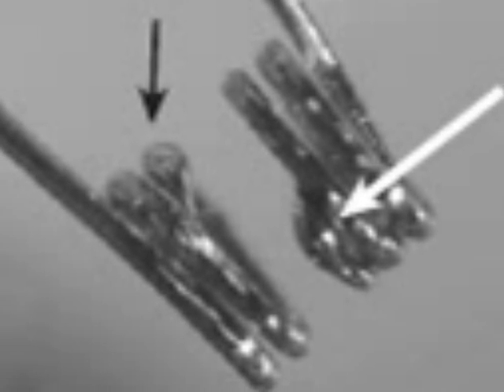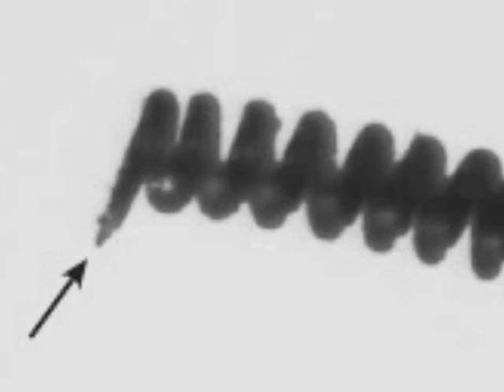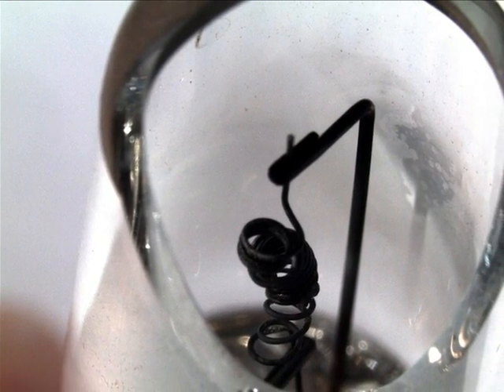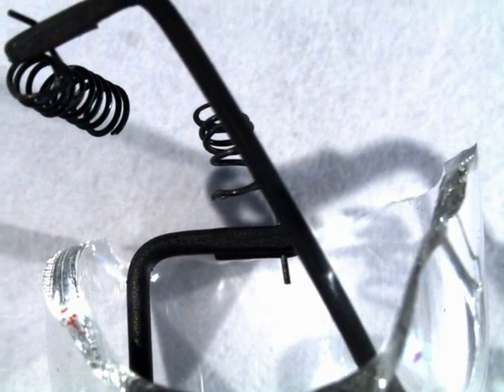A normal burnout of an aged lamp filament will appear to be sagged and will have either tapered or teardropped ends. If a force is applied to a lamp filament when it's cold, it will cause a fracture of the lamp filament. For example, observation of the lamp filament using the stereomicroscope can help to determine the reason for failure if it is a result of a crash collision.